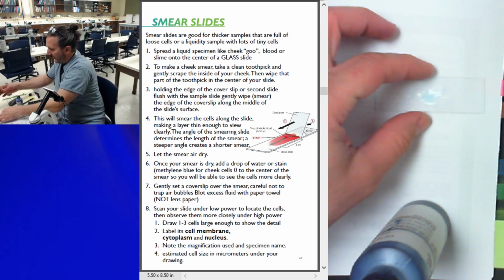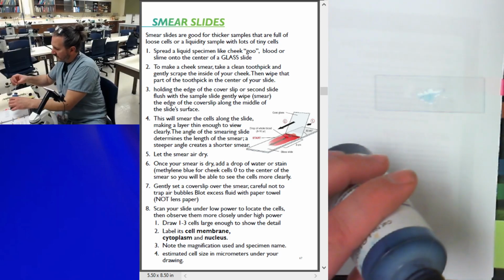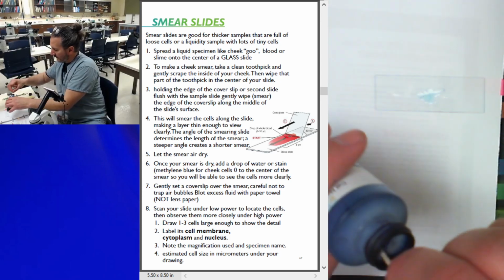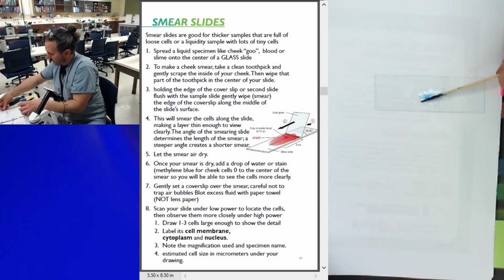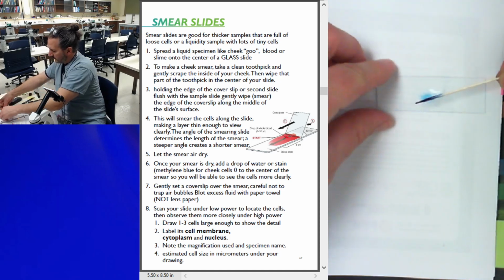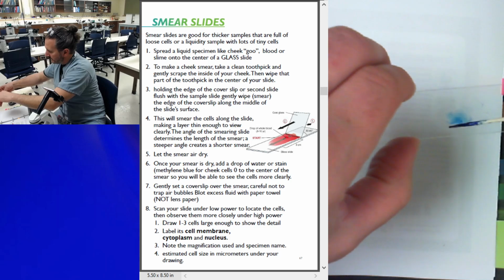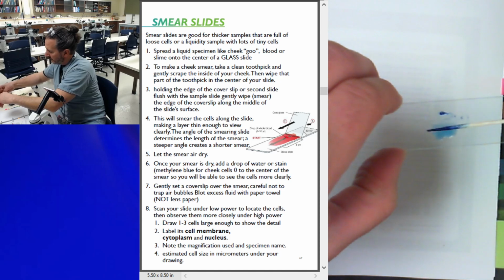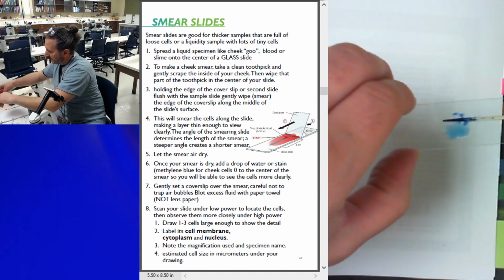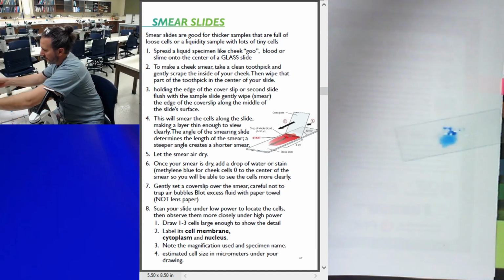I'm not going to stick this back in. I actually have another one that I didn't contaminate anything with. Drop. I'll wipe that off. Because of course I'm going to get some of that tartar onto this, so these two toothpicks are garbage.